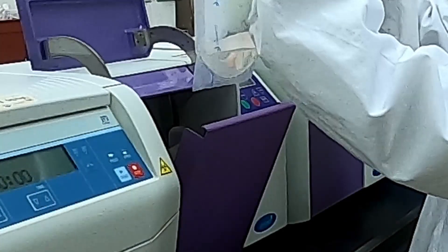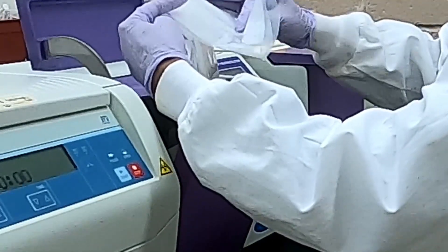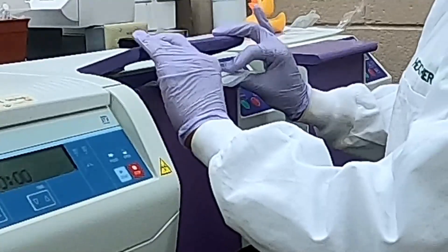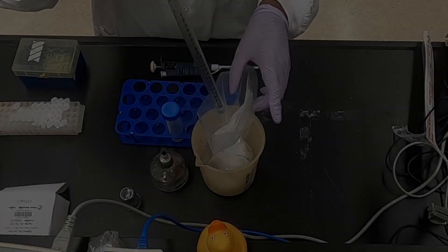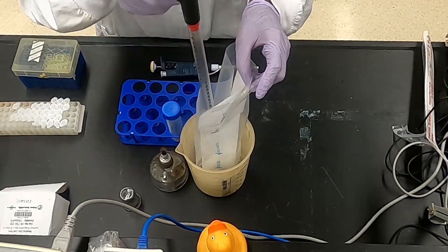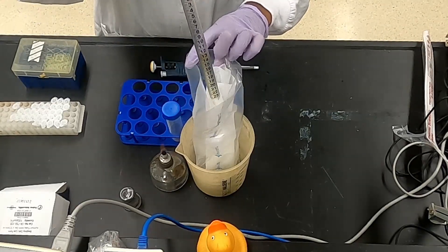The sample is then homogenized using a stomacher machine. An aliquot of the stomached food sample is then taken for further analyses.